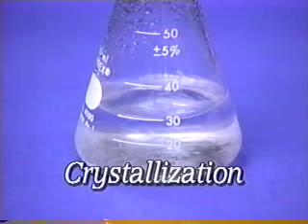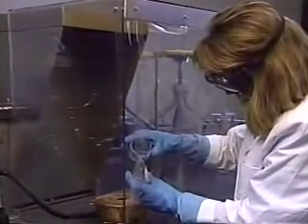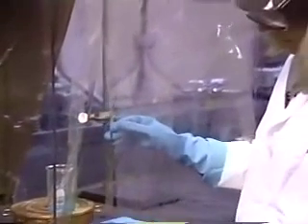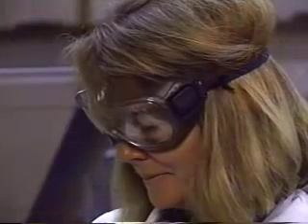Crystallization is a powerful technique for purification of solid organic compounds. The compound is dissolved in hot solvent and the solution is allowed to cool. If done properly, only crystals of the desired compound will crystallize out of the solvent, and the chemist has only to filter the solvent from them to obtain the purified compound.